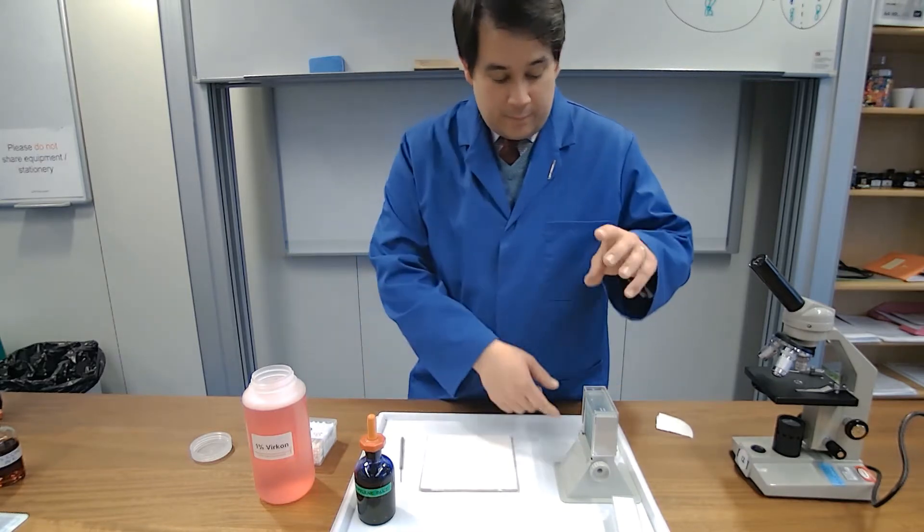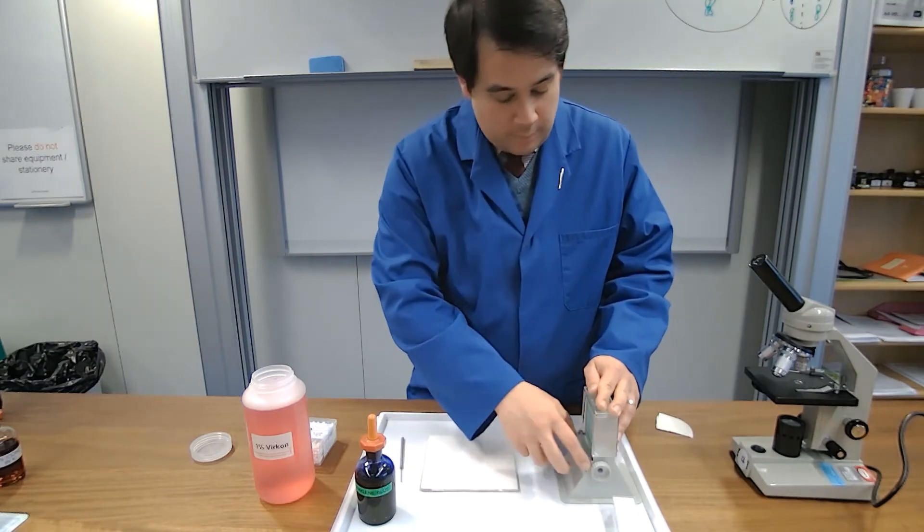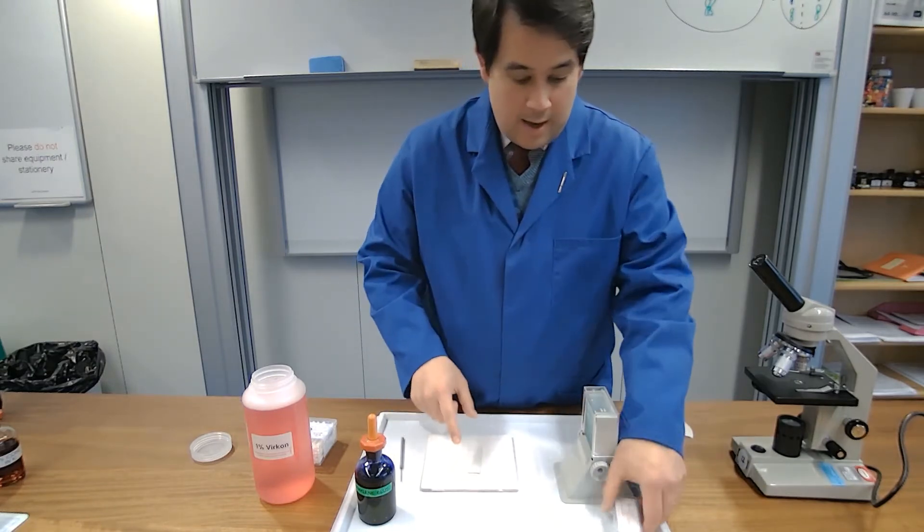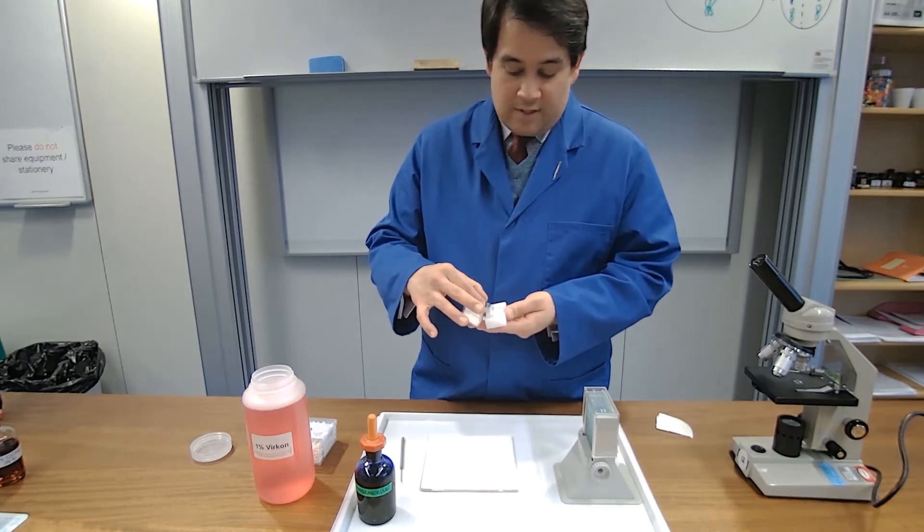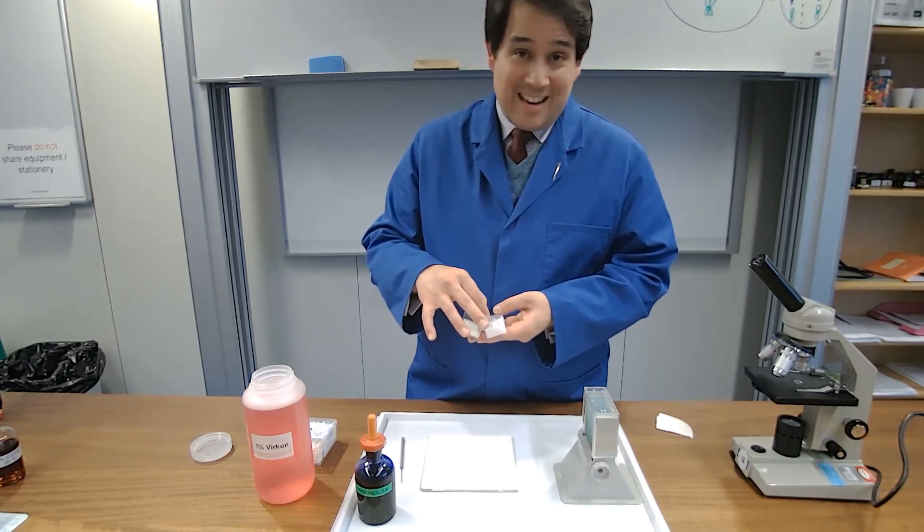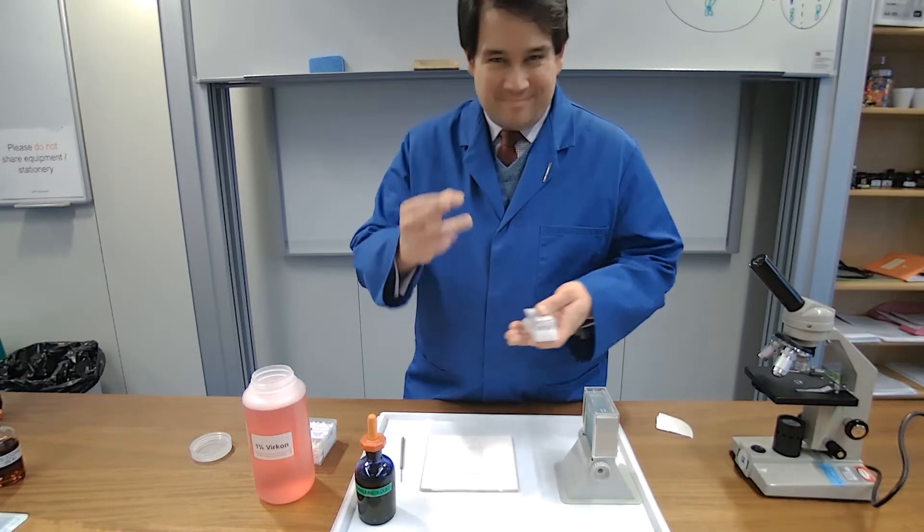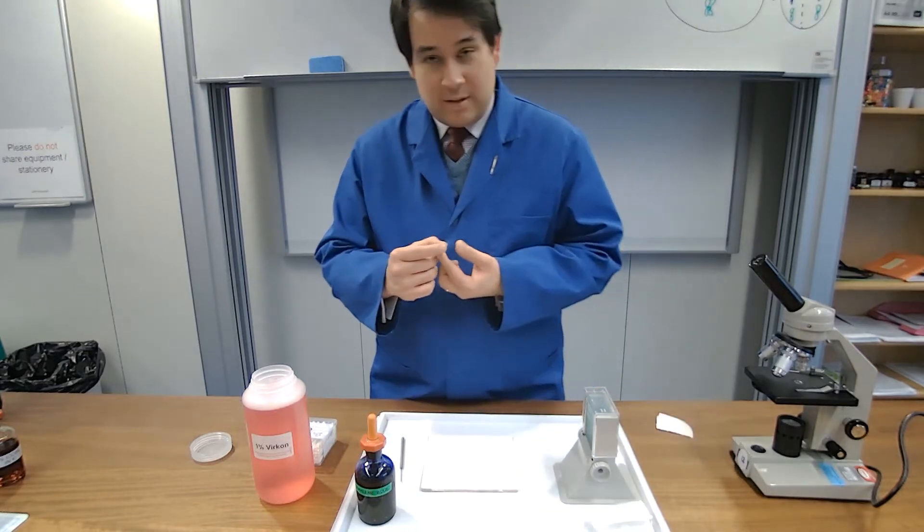First things we need, a slide from my slide dispenser, a cover slip, which is another small piece of glass. The cover slip goes on the slide - slip and slide, there you go, easy way to remember this stuff.